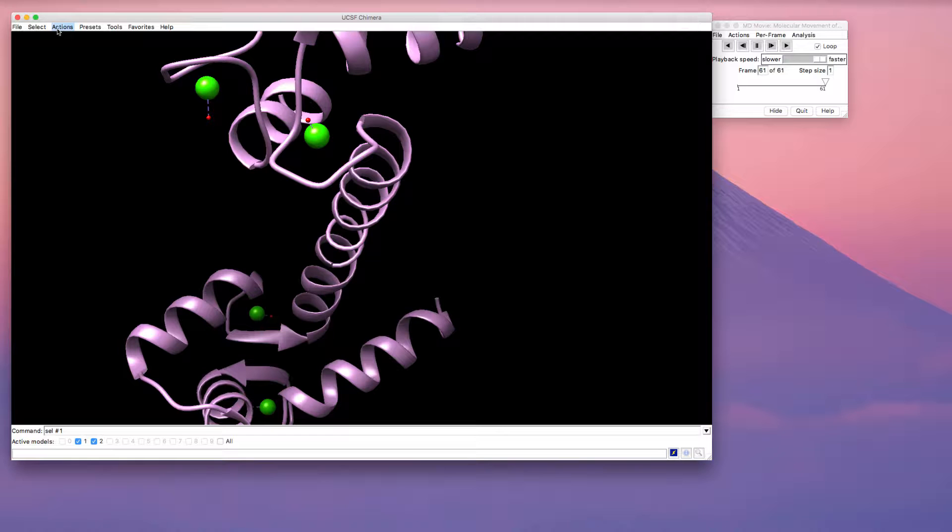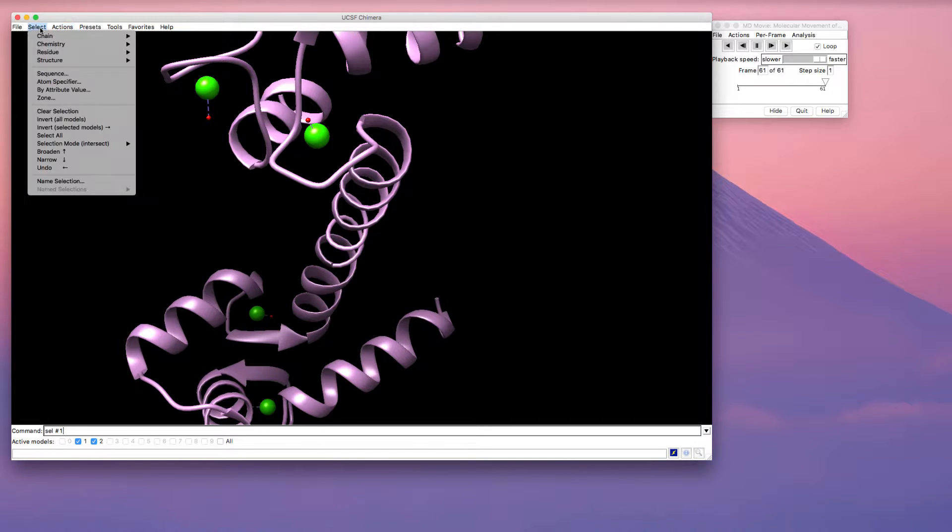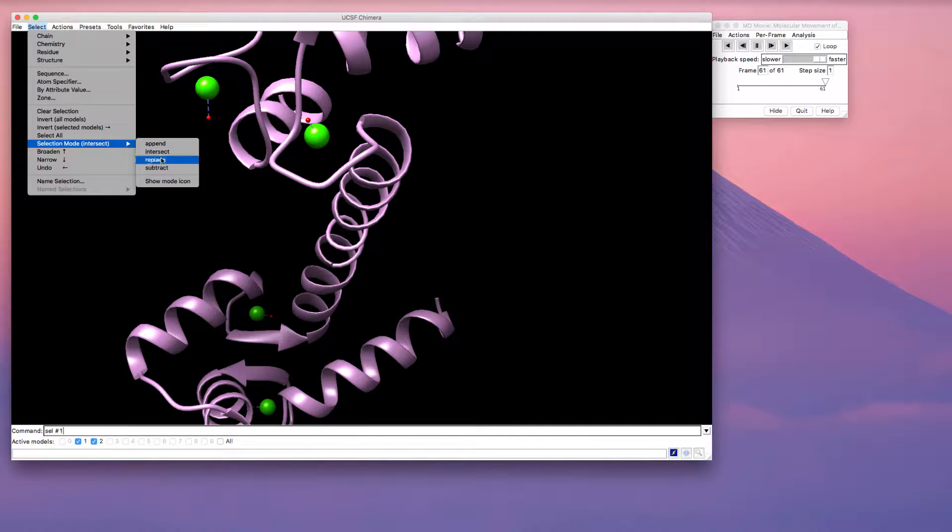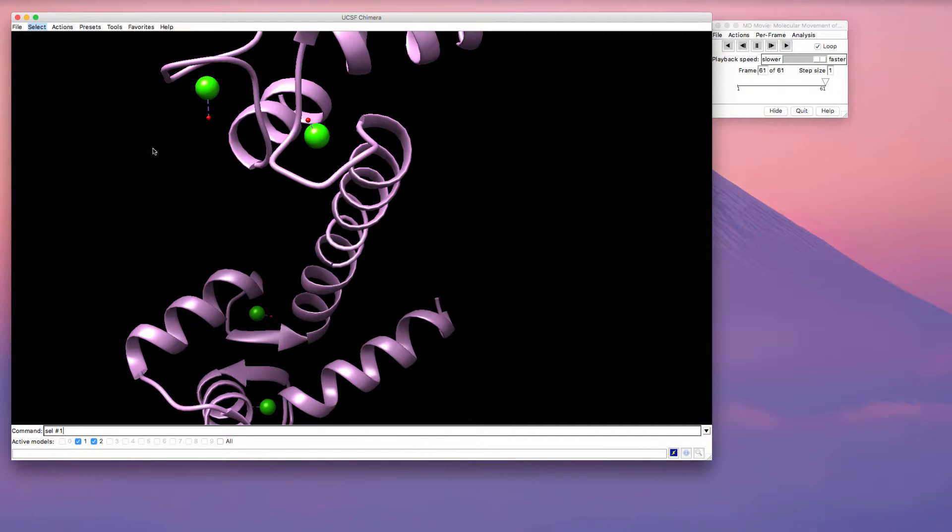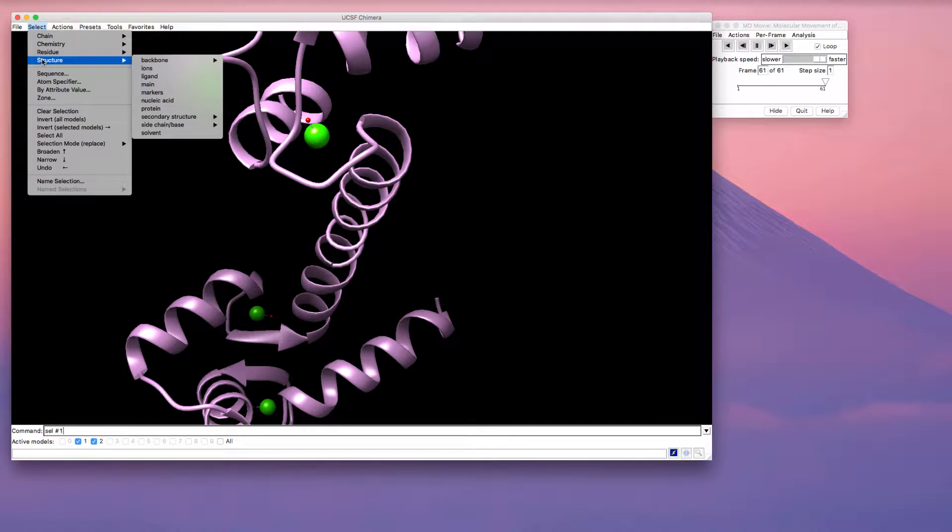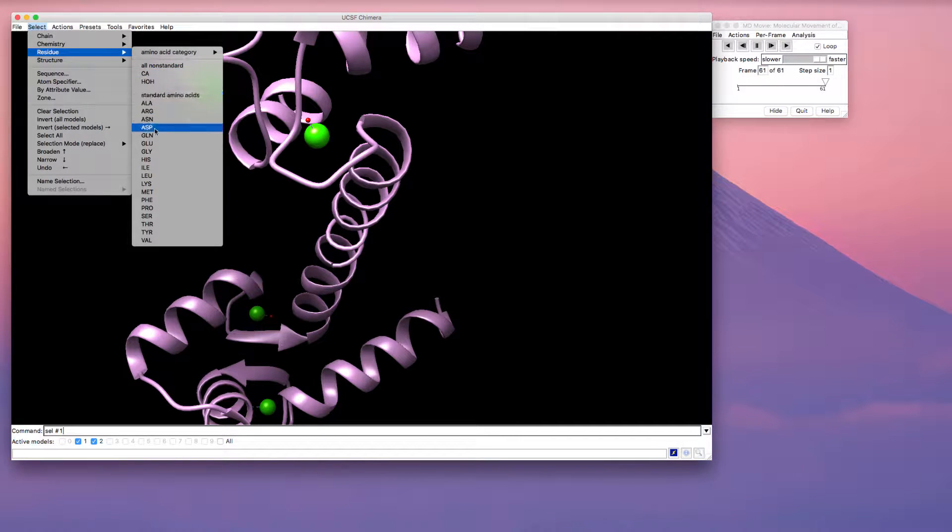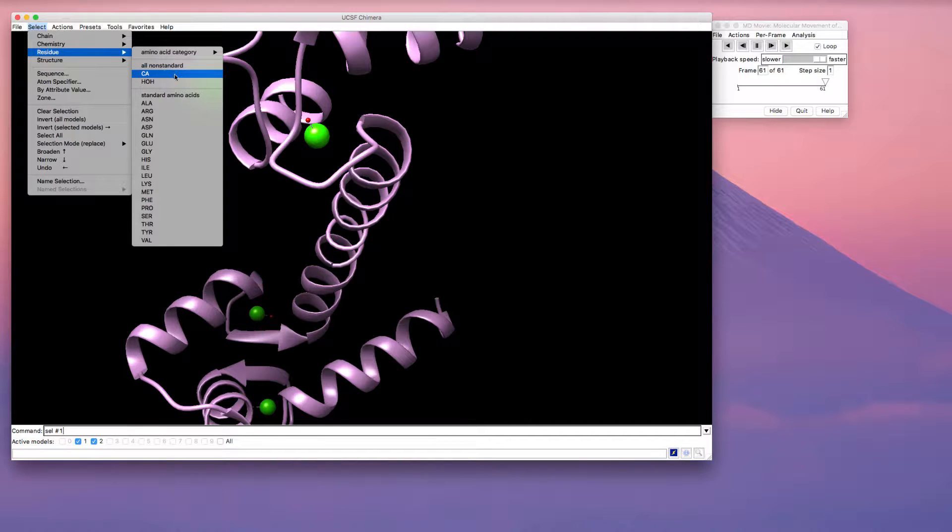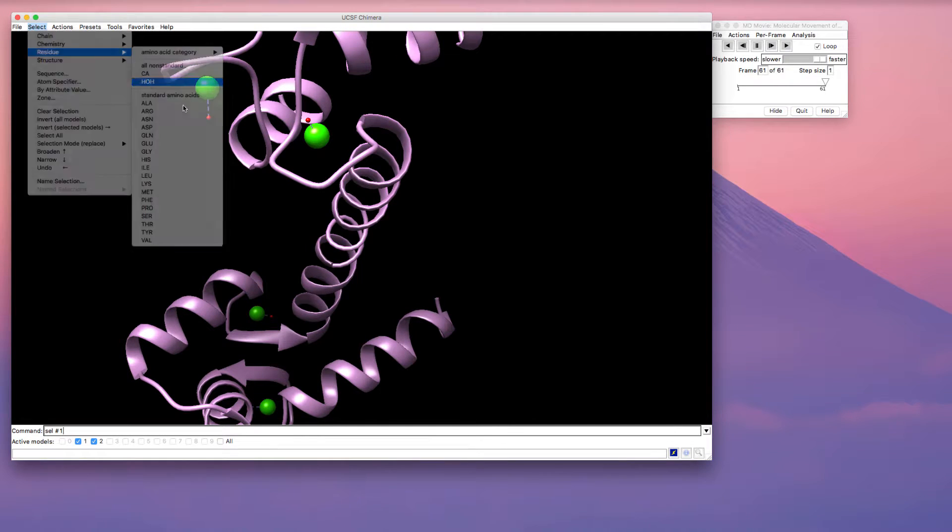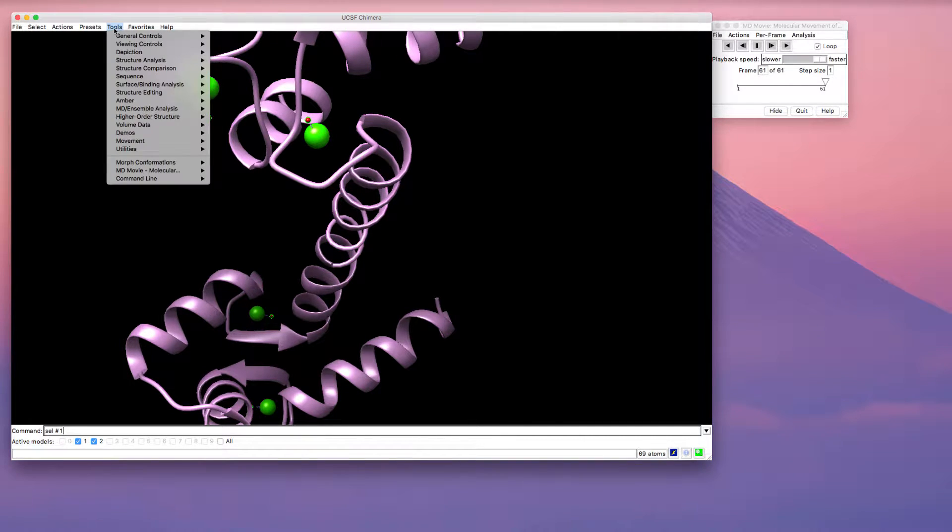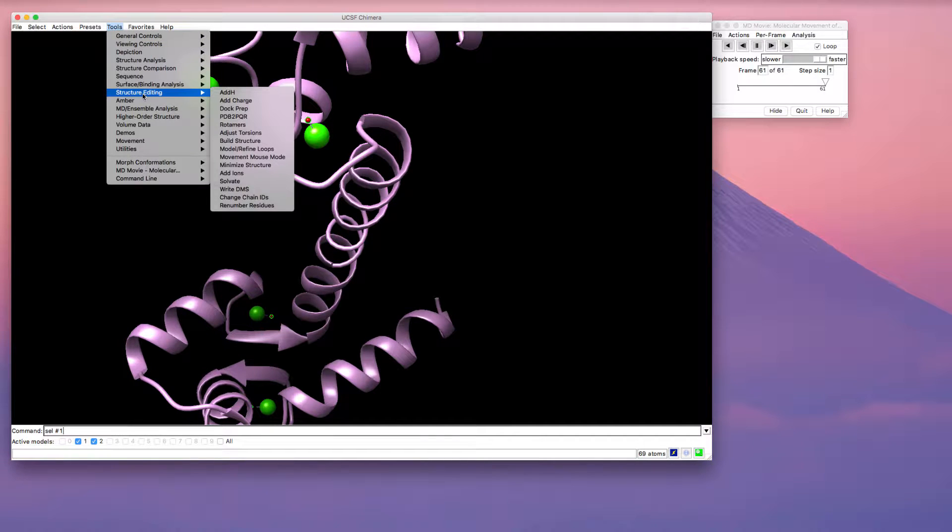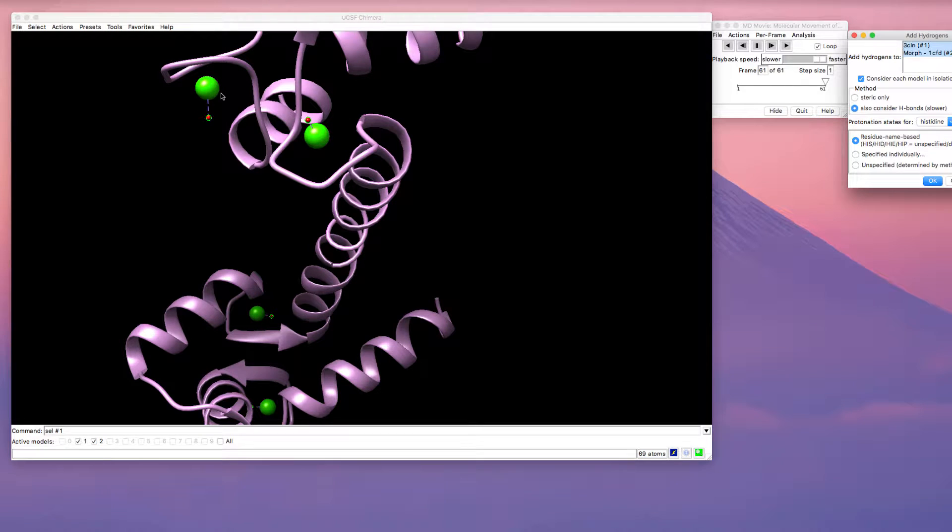So I'm going to select my water molecules by going to select, make sure that this is in the replace mode, and I can select my residue. Notice that residues include our amino acid residues, but we also have calcium and water. I'm going to select water and then I'm going to go to the structure editing and I'm going to add hydrogens.